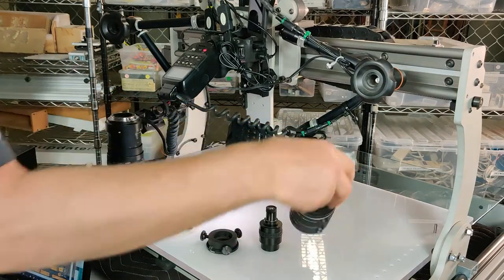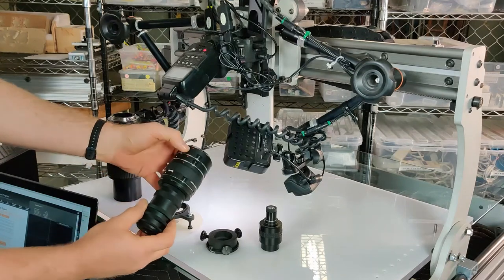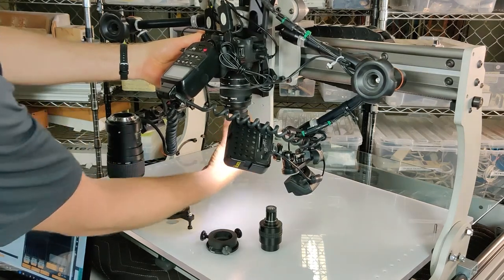The next step is to attach the Nikon adapter stack to the camera. I'm going to line up the red dot with the center of the camera and then turn it until it locks in.